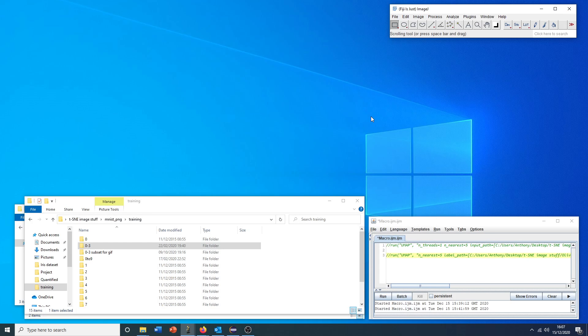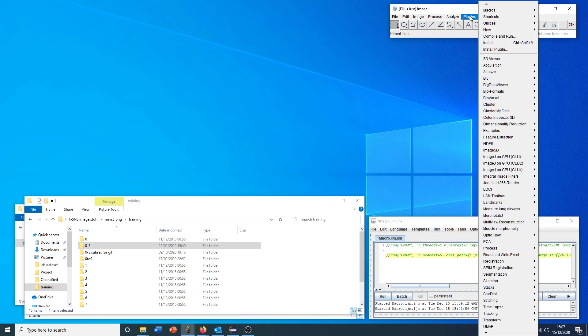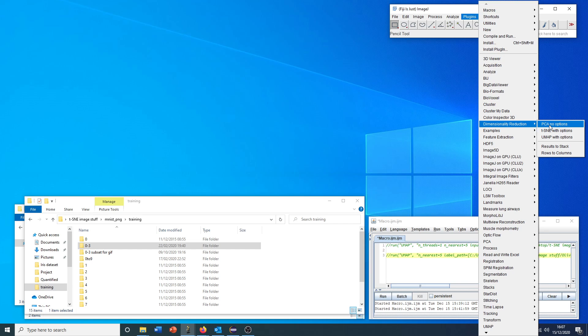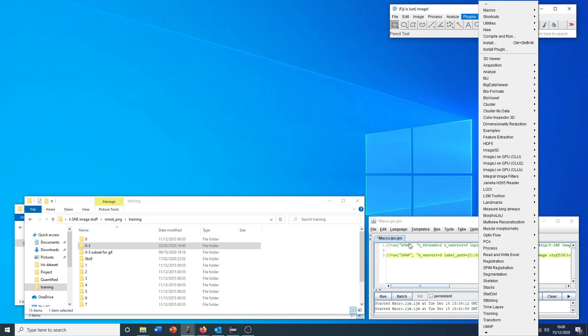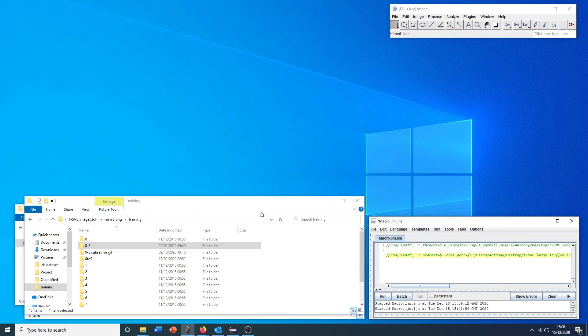So with that out of the way, to run this plugin, we can access it in two main ways. Either via the GUI drop-down, dimensionality reduction, and then we can pick one of either PCA, TSNE or UMAP, or via the macro language. First I'll show you the GUI method.